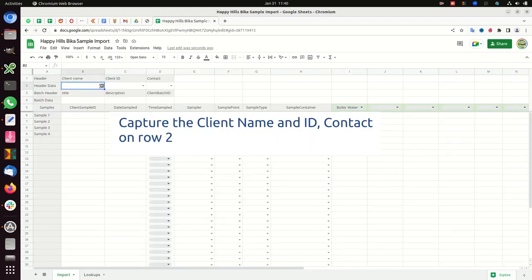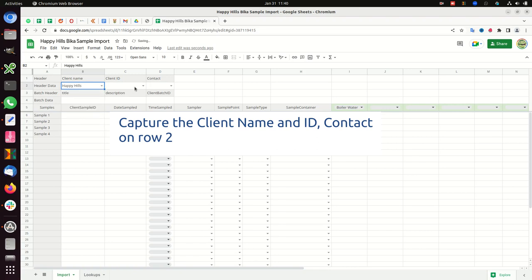On the sheet to be imported, capture the client name and ID, contact on row 2.